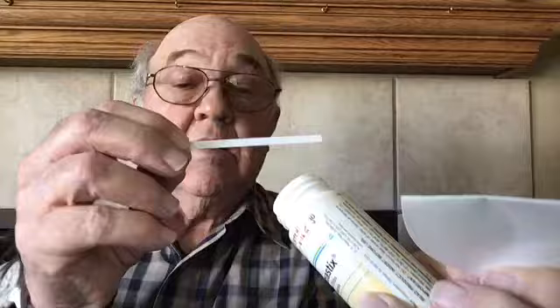Here's the Hemastix. Nice little plastic strip with the chemicals embedded in a pad on the front. That yellow pad has the chemicals impregnated into it.